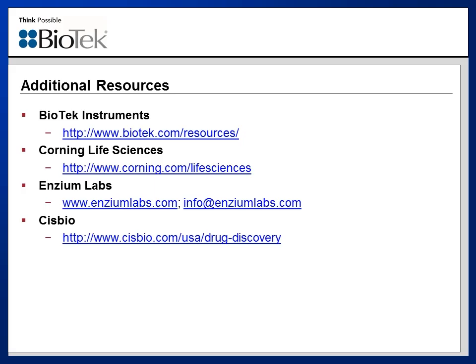So it looks like we have a little bit of time to go and look at a few of the questions that have come in during the presentation. So I'll do that now before we finish up. The first one states, when the spheroid is first introduced into the well, do you centrifuge the plate, and at what time and duration did you take?